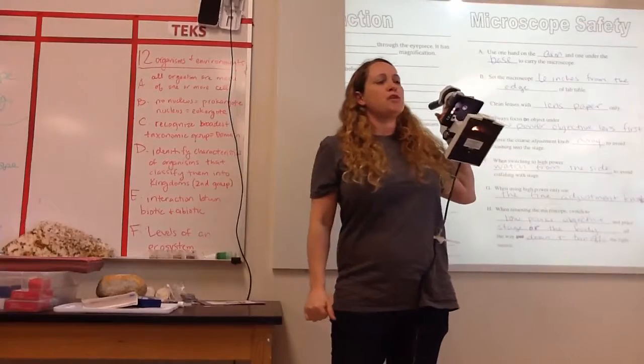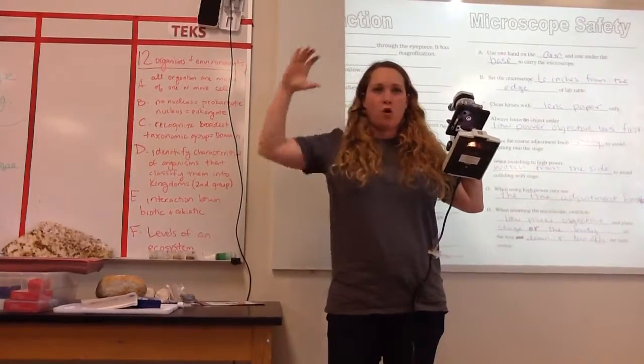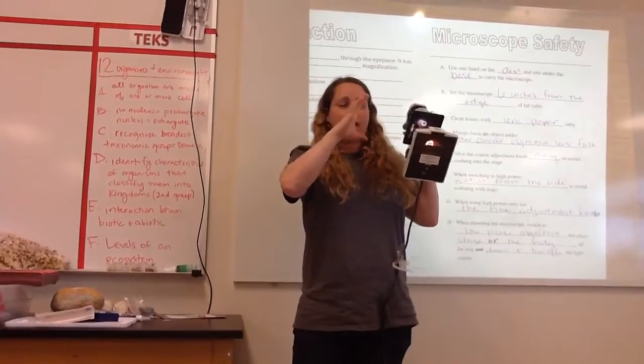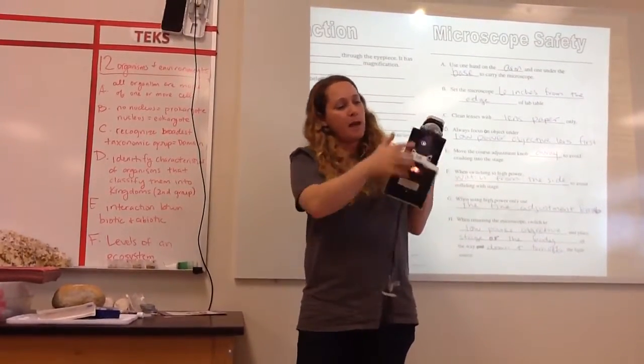In fact, it looks just like a hand pencil sharpener, how you can turn it, and there's all the different size holes for the right pencil. Does that make sense? It has exactly the same thing, but it's not for a pencil. It's for light. Too much light, and the picture's too bright. Not enough light, and the picture's too dim. So you need that perfect amount of light.